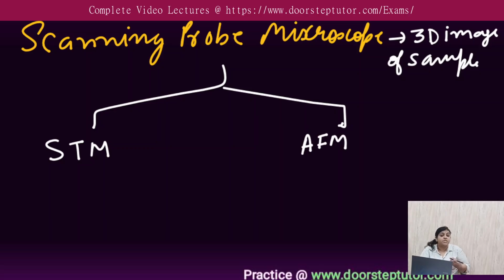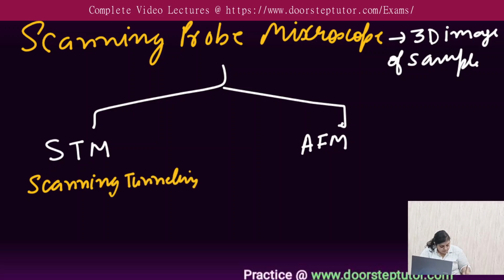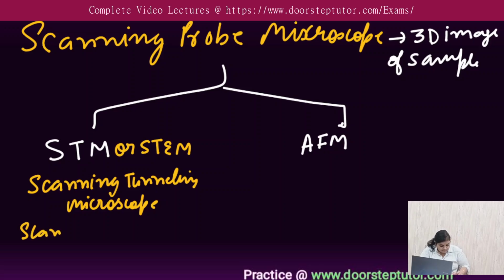STM stands for scanning tunneling microscope, or it is also called scanning tunneling electron microscope. You can call it STM or STEM.